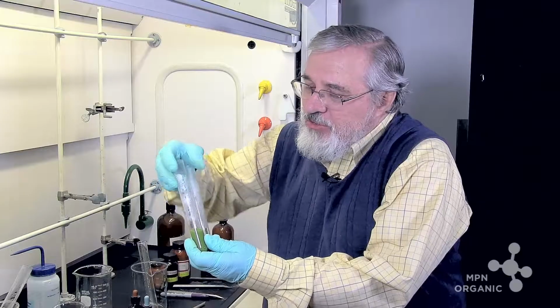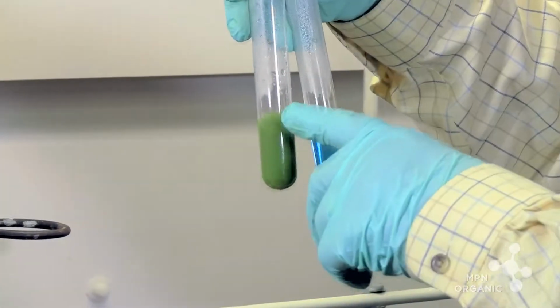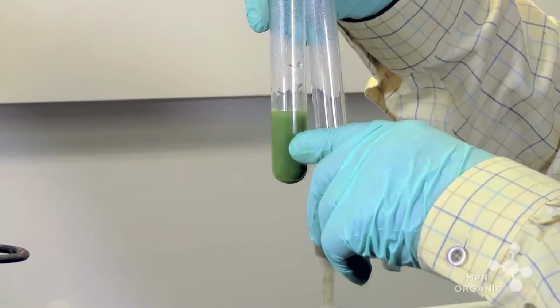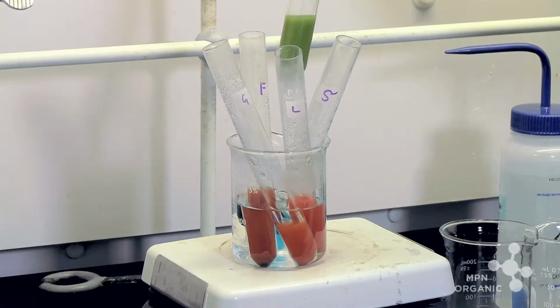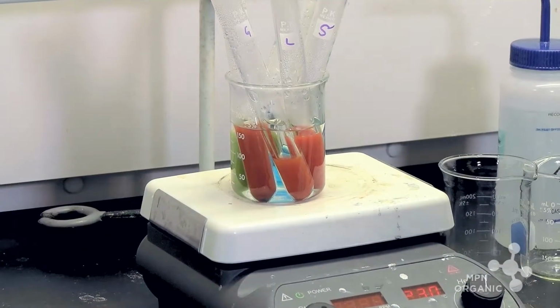Here's the sucrose solution with just the Benedict's in it, and here's the sucrose solution which was pre-treated with sulfuric acid, so that it's starting now to change color and looking more like the 3 that we have here in this hot water bath. So I think if we just allowed this to stay in the heat a little bit longer, we would probably see an orange, but since we don't have that color yet, let's just wait.